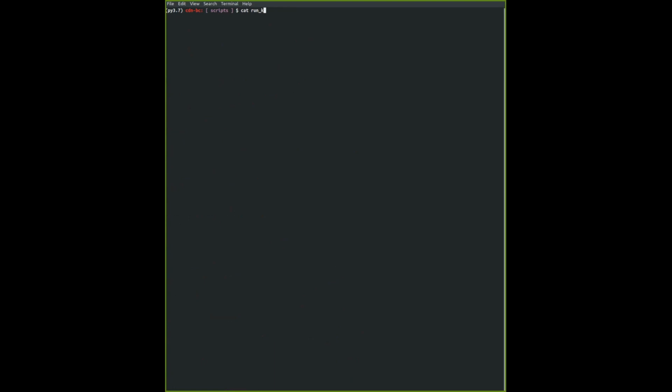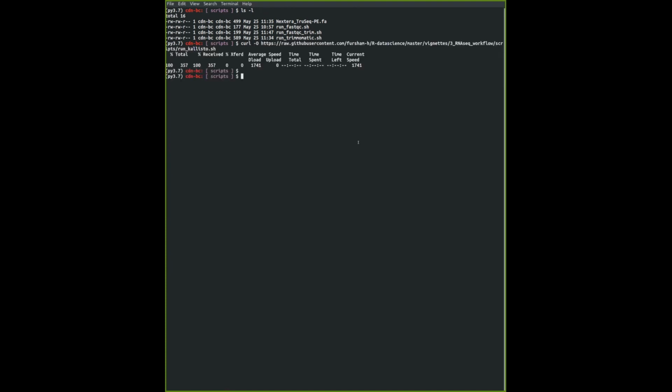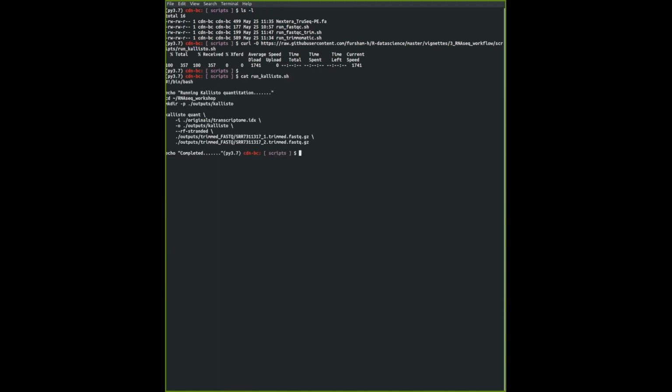Did I have it wrong? Kallisto... Oh, did I download it? Yeah, probably I did download it. I thought I did. Okay, I'm going to download it as well. Cat run Kallisto. Yep, okay, so it's here.